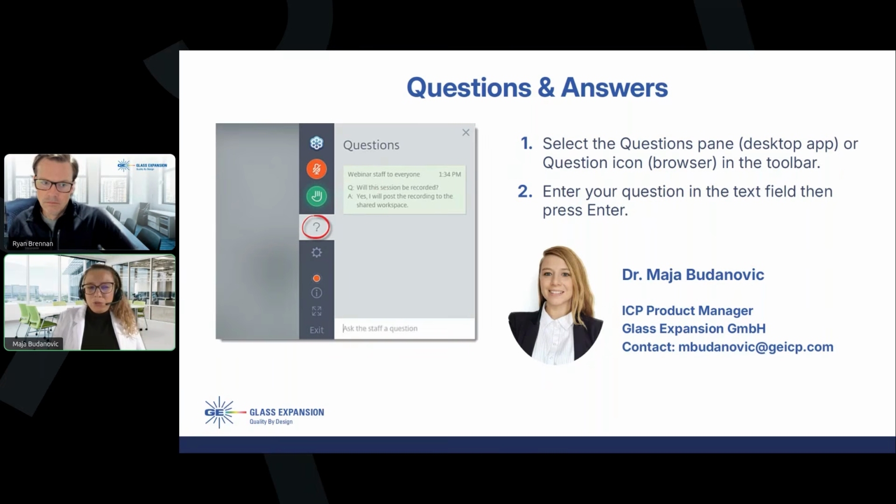If it's a salt, usually it can be recognized by this white remaining deposit on your outer tube, and that can usually be removed just by soaking. We use the RBS 25 Fluka solution that works very well if it's a salt deposit. And if you have some kind of metallurgical samples or you think that the deposit comes from metals, you could also soak the portion of your outer tube that is dirty and needs to be cleaned in the acids that you use for your sample preparation. Of course, not HF, but that usually helps.